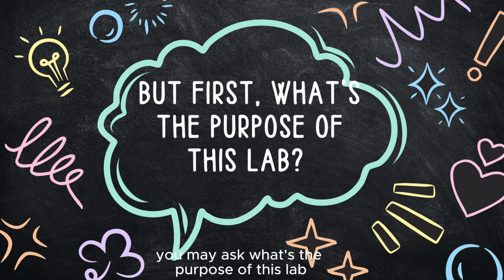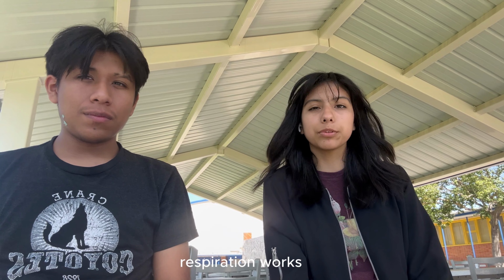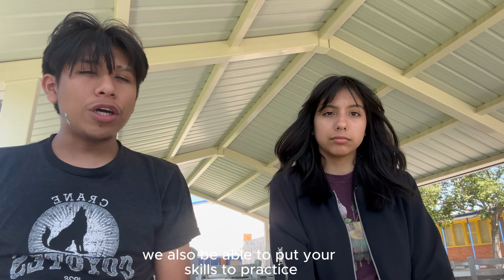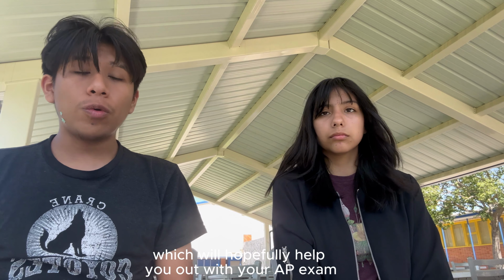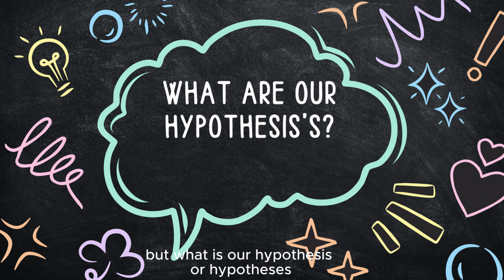You may ask, what's the purpose of this lab? The purpose of this lab is to gain a better understanding of how cellular respiration works and which factors affect the rate of it. Not only will you be able to enhance your knowledge, but you'll also be able to put your skills to practice using things such as data analysis, which will hopefully help you out with your AP exam this May.